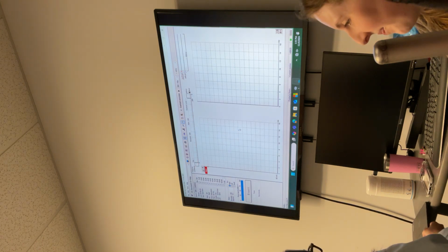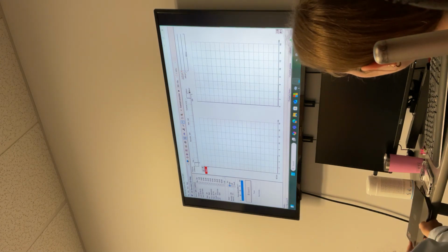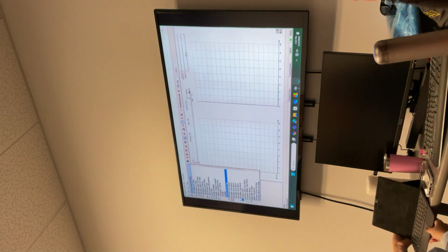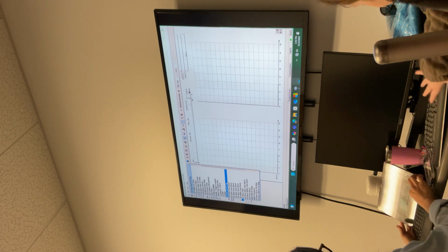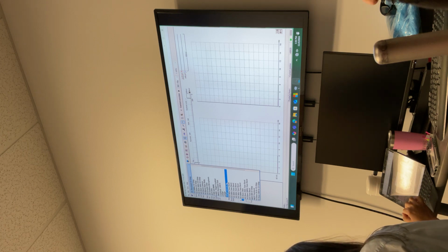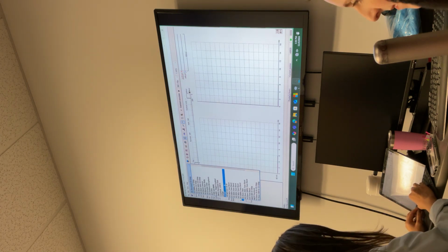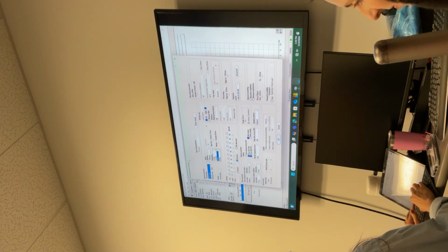So just to refresh you, I'm going to start playing all the stimuli, like what we did last time, with the loopback. With the loopback, the transducer output is going to this loopback box that's picked up by the electrode and going back to the system. This way you can visualize the stimulus you're playing, the stimulus waveform and all that. So I'm going to select loopback, protocol. So click.